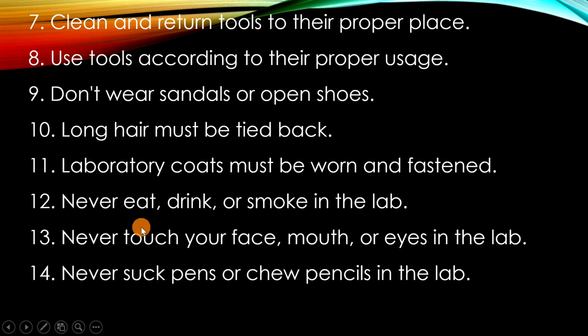Then never eat, drink, or smoke in the laboratory. Eating, drinking, smoking is not allowed, because by eating or drinking you may swallow harmful chemicals together, or you may smoke together with the harmful chemicals. Also never touch your face, mouth, or eyes in the laboratory. The same reason: you might transfer chemicals into your mouth, your eyes, and your body.